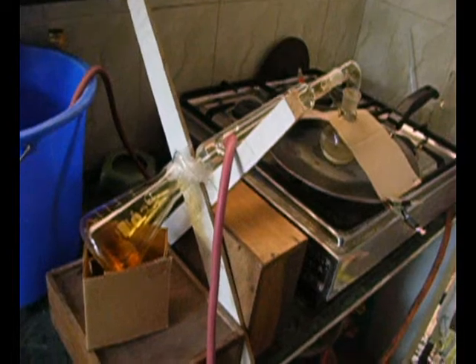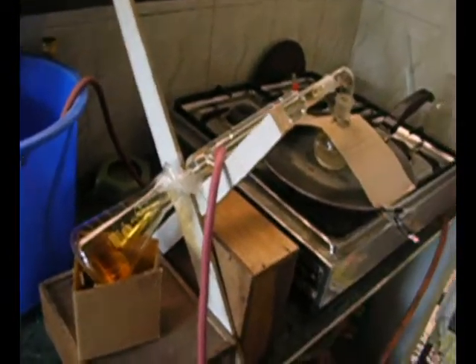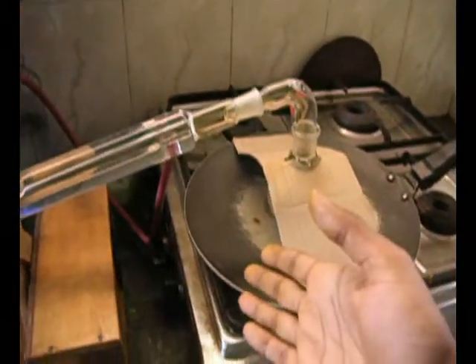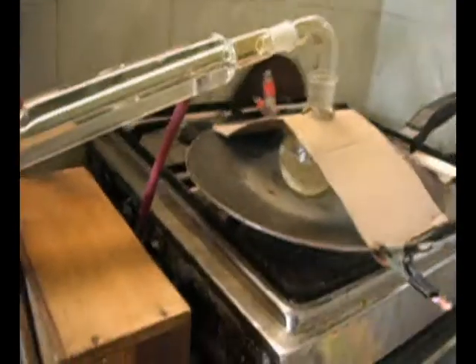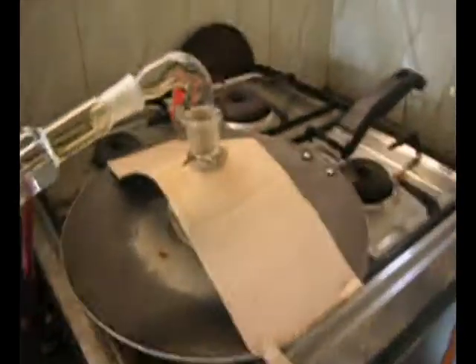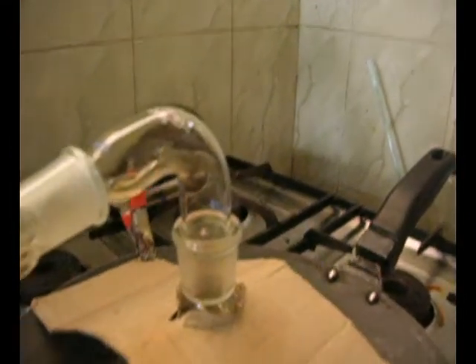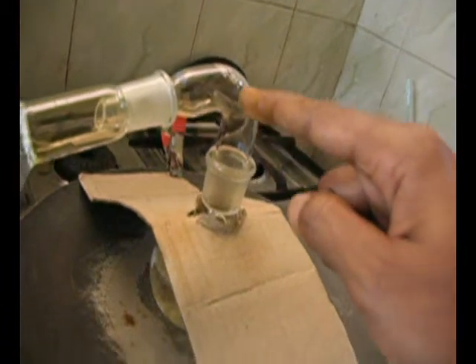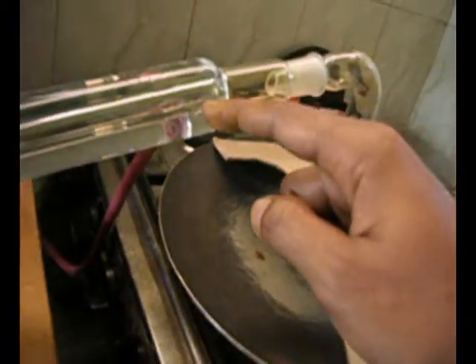Here I synthesize very pure nitric acid of concentration greater than 95%. In this flask, a nitrate salt and concentrated sulfuric acid of about 98% are added. They react to form a sulfate salt and nitric acid. The nitric acid evaporates, passes through this tube, and gets into the condenser, producing very pure nitric acid.